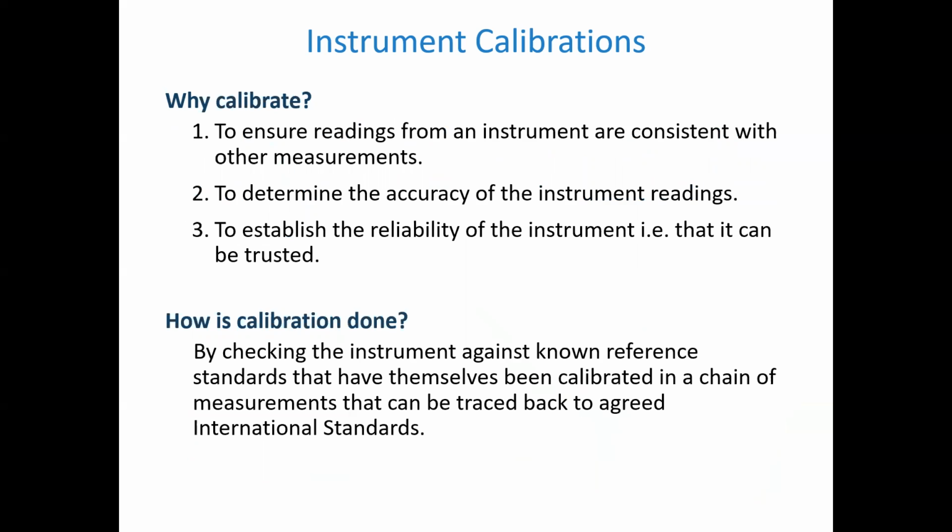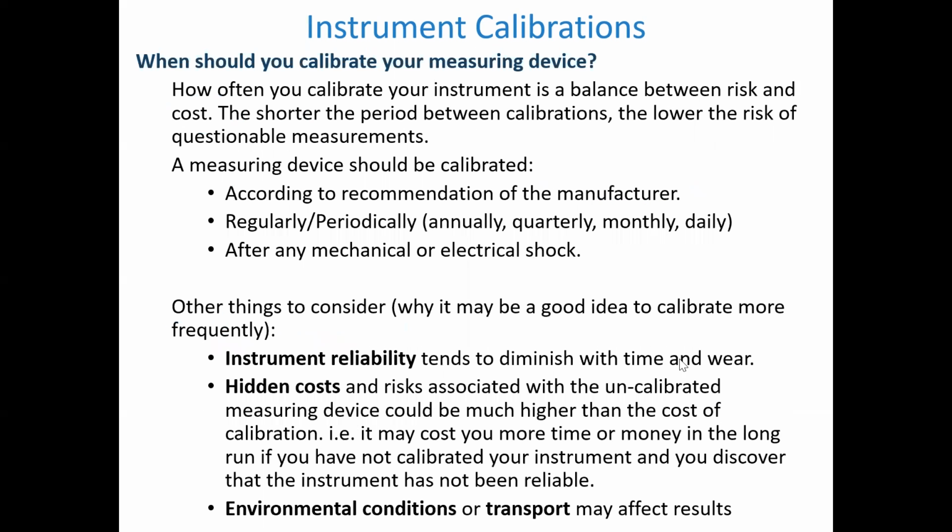As you've seen in the lab, typically what it means is you're measuring some sort of standard, and hopefully the idea is to be relatively consistent. You want to make sure that your instrument is reading things properly. How's calibration done? I think we've talked about this already. Sometimes we calibrate because it's actually recommended by the manufacturer. Let me take a look on the next page here, when you should calibrate. It kind of depends on the device.